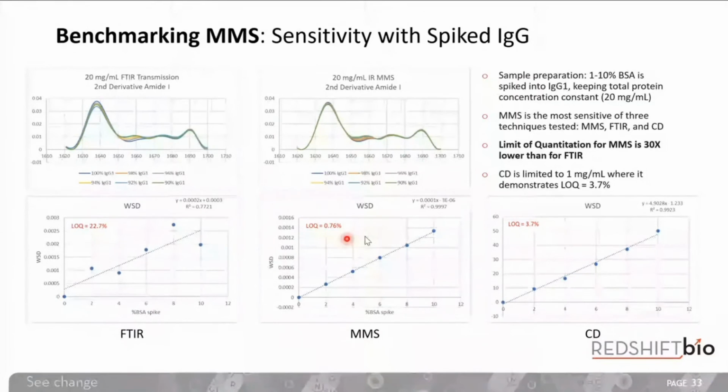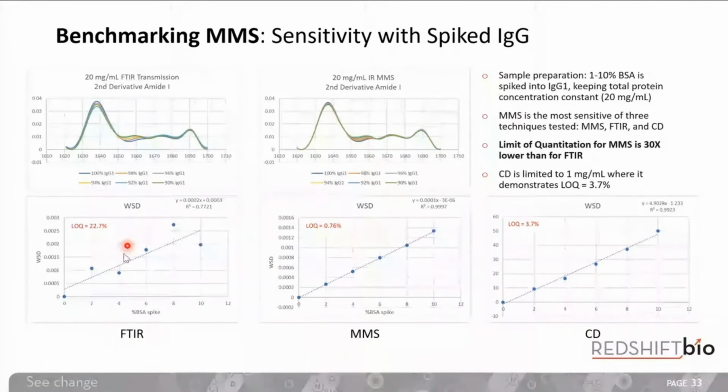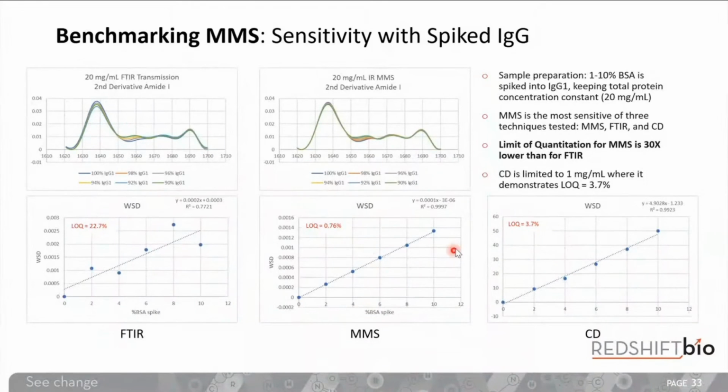When you look at the lower limits of quantitation, or what percent of BSA could we reliably detect in that solution, MMS was able to see 0.76% BSA. We could detect less than a 1% addition of BSA, or a 1% change in secondary structure. FTIR was closer to 20%, about 22%, mostly due to the high variability that you see with FTIR. It's not automated. It's not nearly as user-friendly. CD does better. CD was at about a 4% limit of quantitation. So CD was able to see smaller changes.